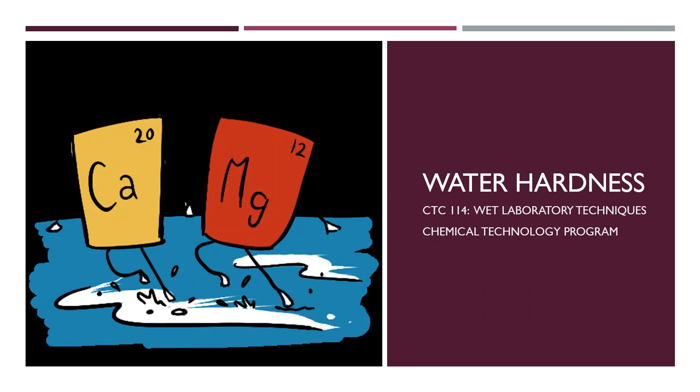CTC 114. Guess what we have in store for you today? It's another lab experiment, and this lab experiment is going to focus around water hardness. Now, what is really water hardness? What is that all about? I mean, can water actually be hard? Like knock, knock, knock hard? No, that's really not what we are referring to here at all.